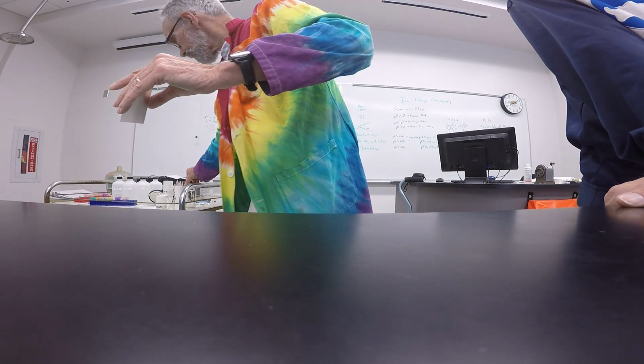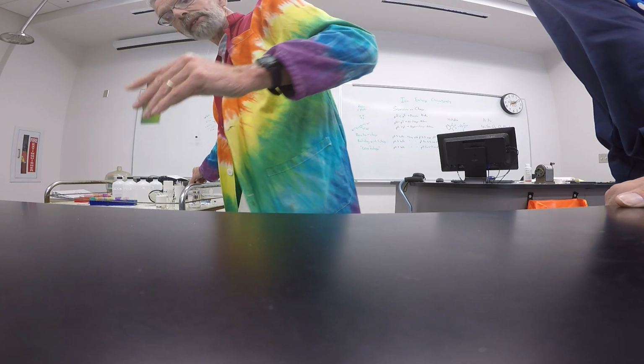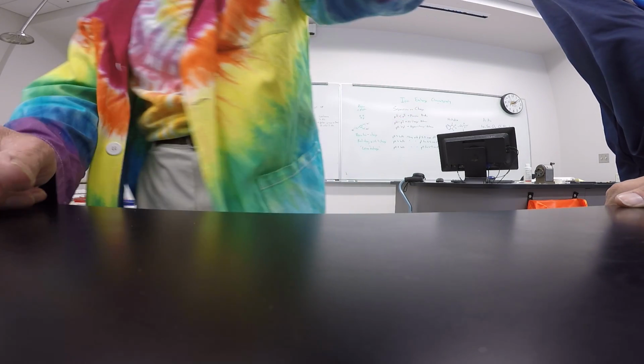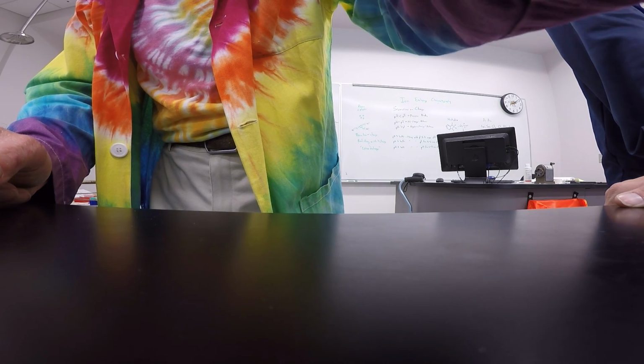You'll have your solvent in there first. The PAW solvent is right here. That should just fit in the bottom of the 100 ml beaker and sit upright. And then put the watch glass over the top.